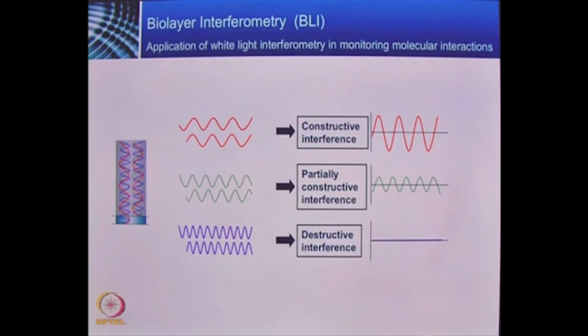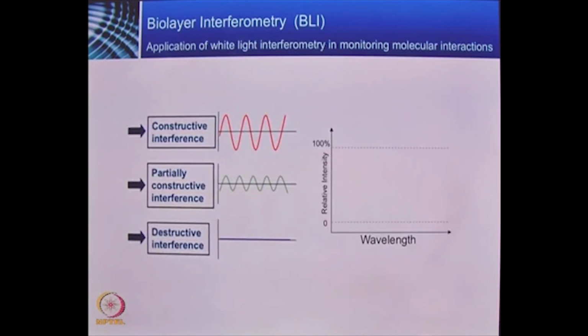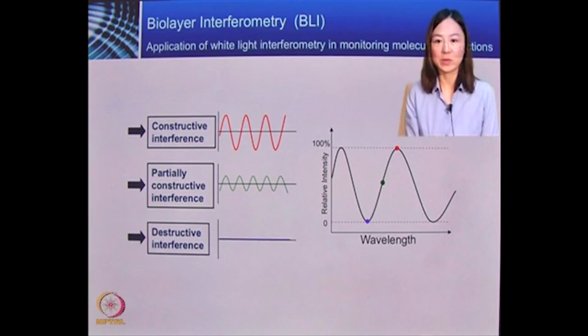No matter what, the system will monitor the two reflected beams and plot the composite of the two wavelengths on an XY plot. By plotting the wave pattern of these different waves on this XY plot, we can get an original wave pattern.